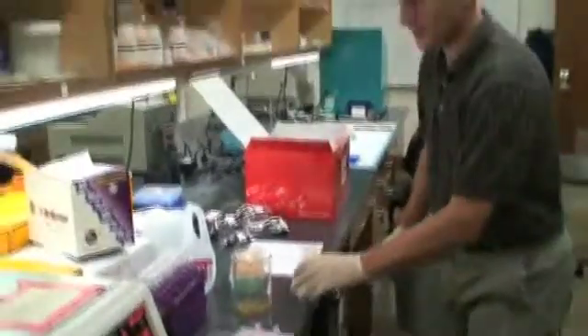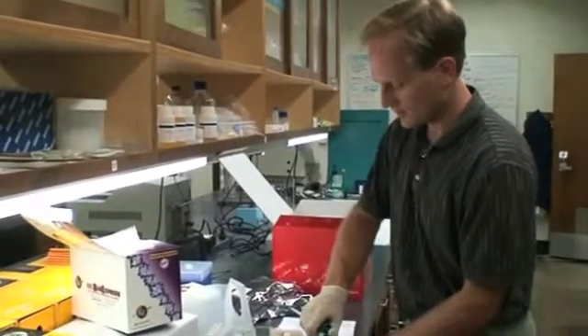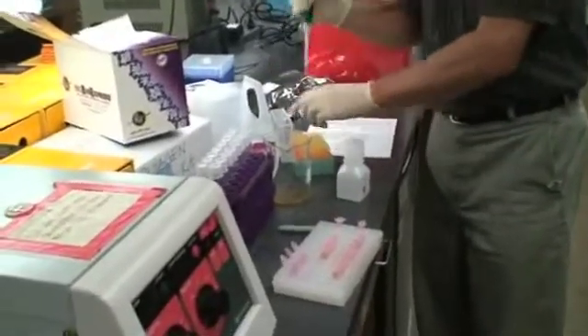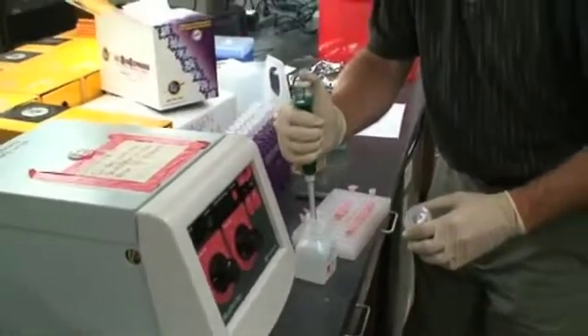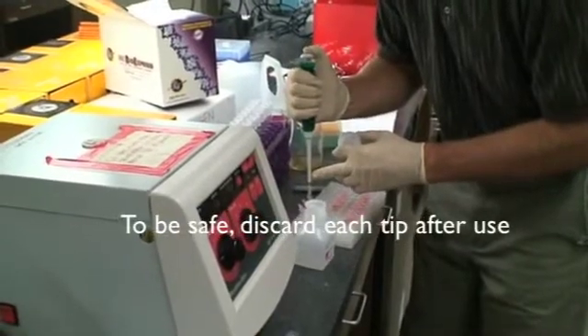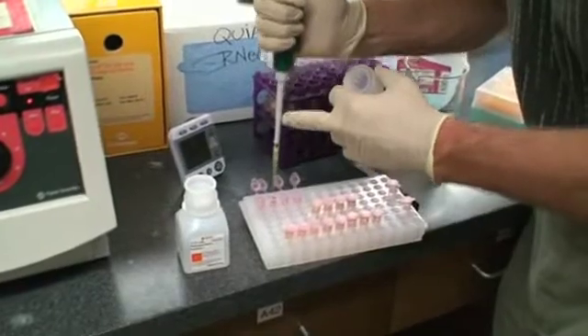I'm going to show you the process and then finish all 16 here. This is the resuspension solution — I have added the RNase to it and mixed it. I have 200 microliters here. If I touch the tip to one of these tubes, then I'd have to change the tip obviously, so I'm trying not to. I'm just putting in the 200 microliters on top.